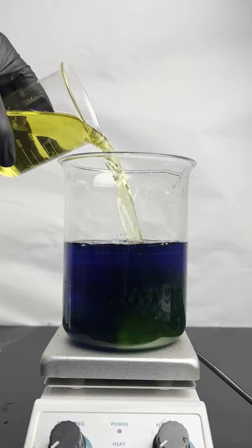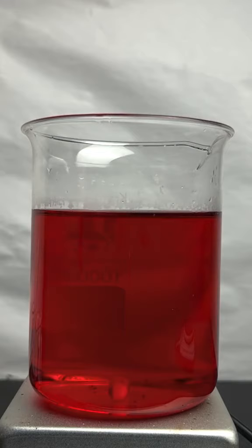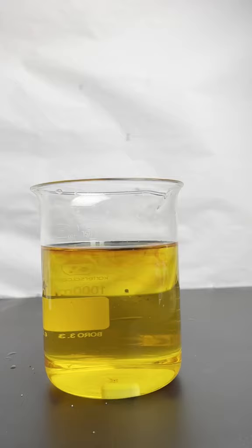Because when you add a solution of glucose and sodium hydroxide, it does this. The indigo carmine is reduced into a red intermediate, and then it is further reduced to this piss color.